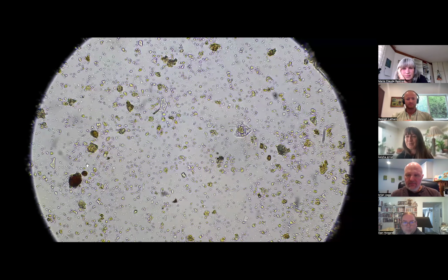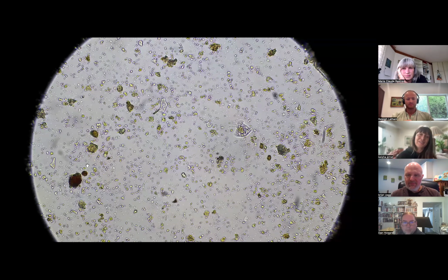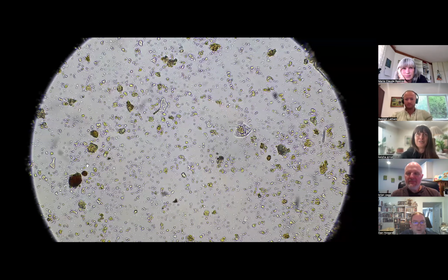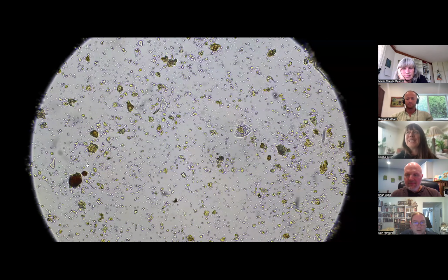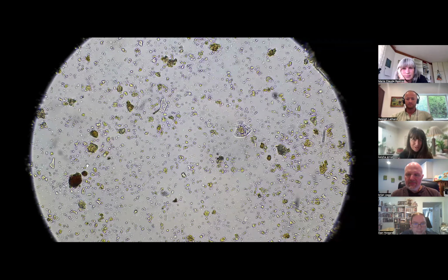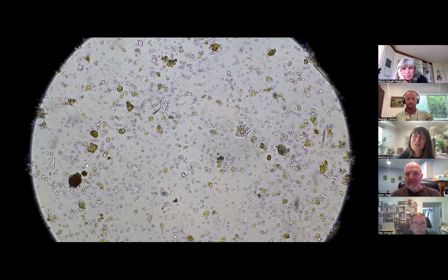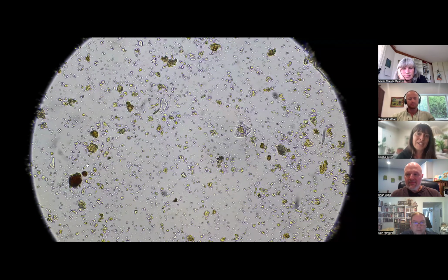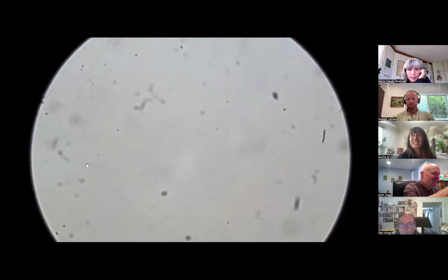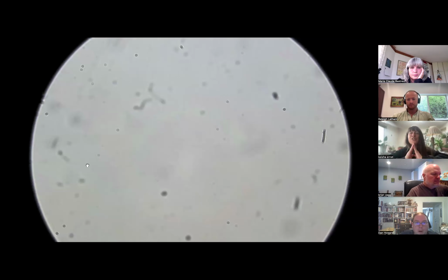But then when we're comparing something like JMS to, say, a compost tea or a compost extract that is aerobic, I think there can be some differences to point out. I think maybe you could put up your anaerobic sample right now. I'm hoping that it's as busy as I'm assuming it is, because the anaerobic samples, I've played around with anaerobic. There are so many different preps, and you really do see a huge diversity of bacteria.